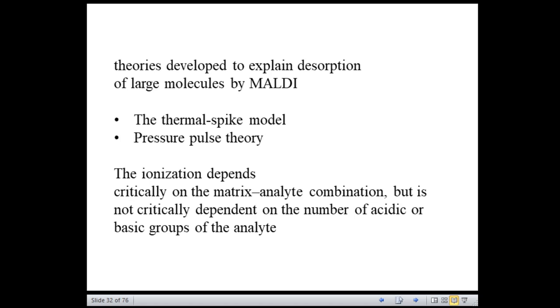So what does this essentially mean? There is a poor vibrational coupling between the matrix and the analyte. The matrix first takes the energy, transfers the energy to the analyte, and the analyte, as a result of local heating, shows a rapid rise in desorption efficiency.